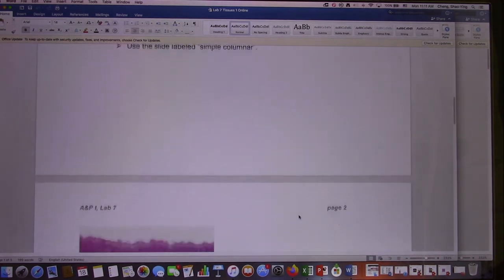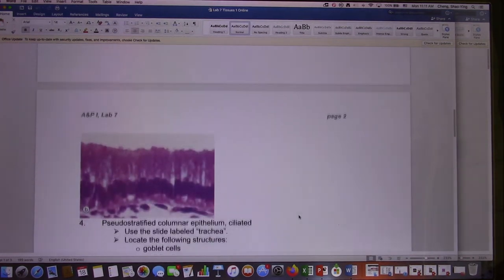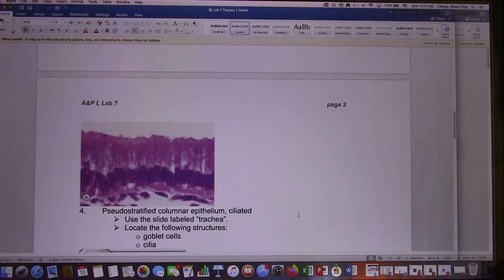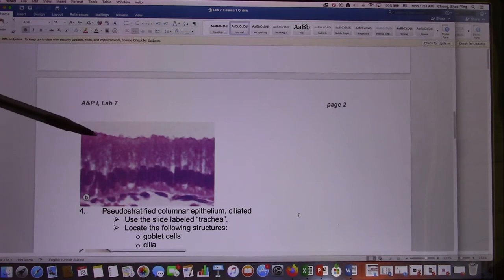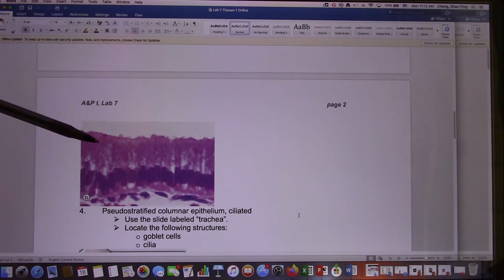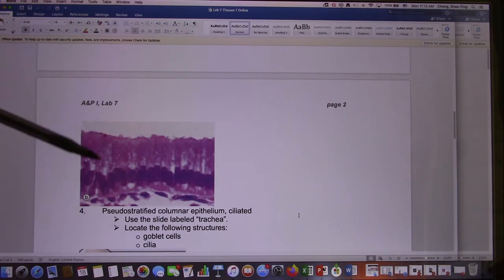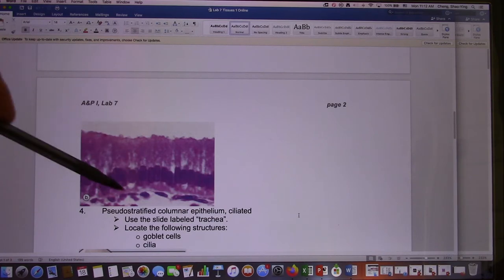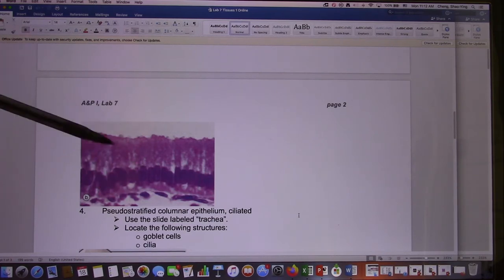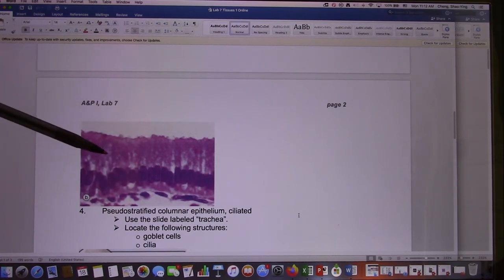Next one: simple columnar. I will point at this cell and ask you what kind of epithelium it is. This is one layer and it's long-shaped. So this is simple columnar epithelium.